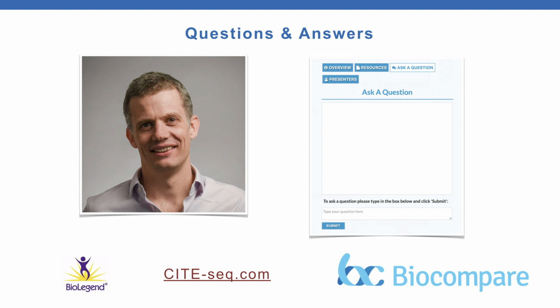All right, so Peter, it turns out the next question wasn't a question. It's a statement from Patrick at BioLegend. He wants people to know that the TotalSeq-A antibodies are definitely working on version 3 of 10x. Thank you, Patrick. We agree. I hope that was clear in the presentation today.